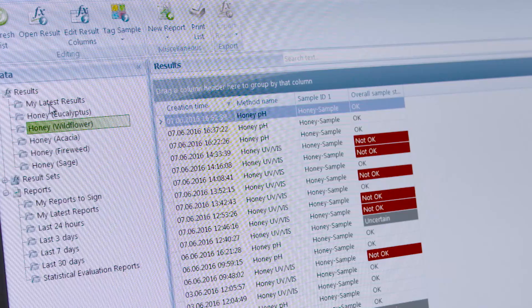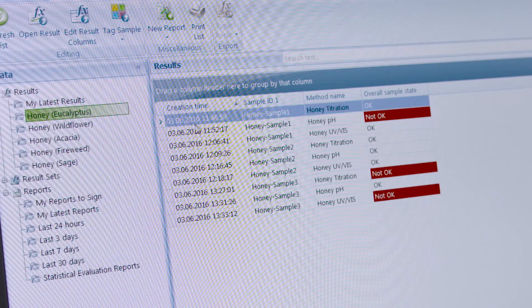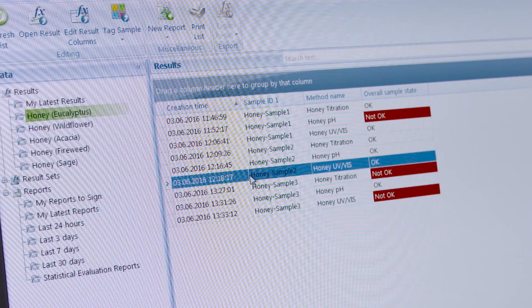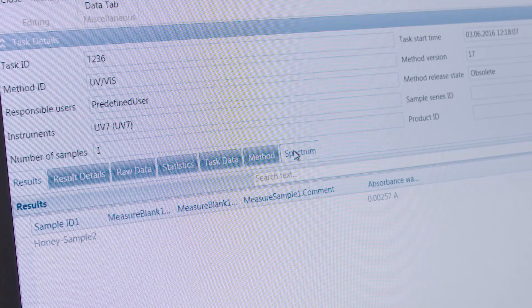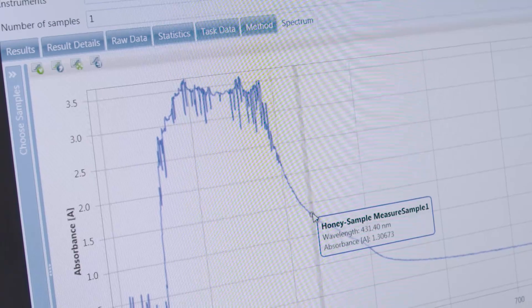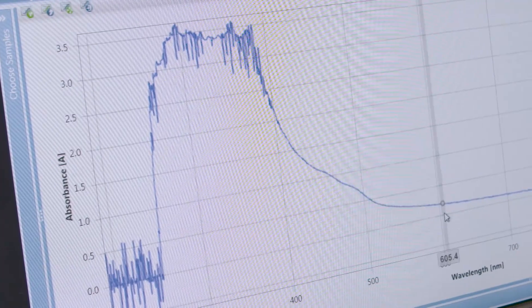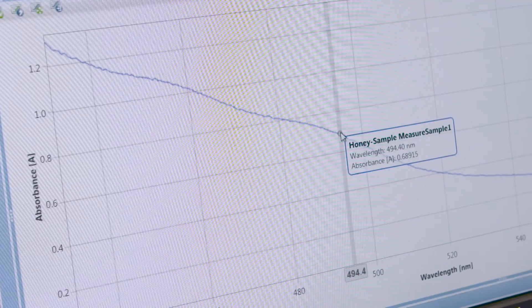Task results can be collected in a search folder. Search folders contain amounts of data which satisfy combinations of multiple criteria and a series of predefined filters. The representation of data results can be adjusted via zooming of a chart's diagram.